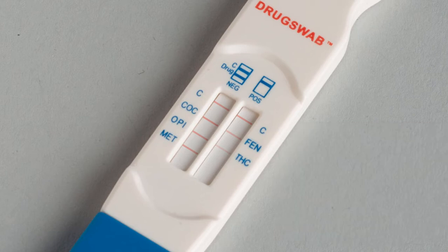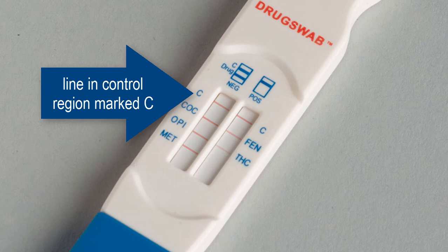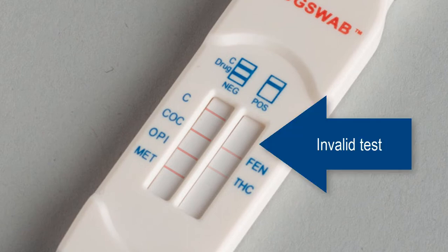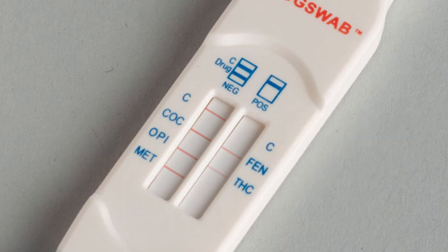Interpreting test results is easy. First, ensure that the test is performing properly by looking for the presence of a red colored control line on each strip in the control region marked C. If no red line appears next to either C, the test is invalid and should be discarded, and the operator should perform another test using a new test kit.